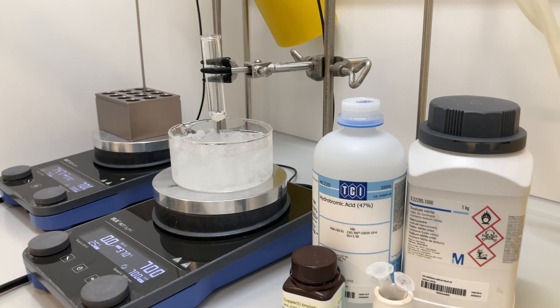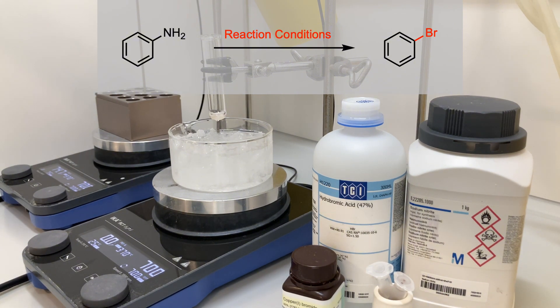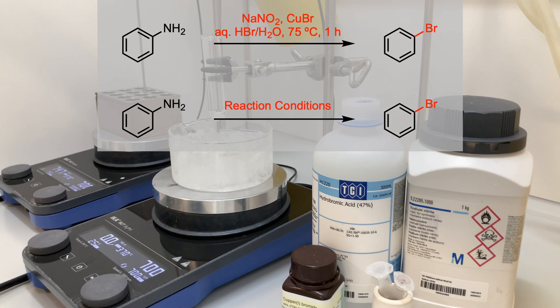For this experiment, I wanted to convert my aniline into the corresponding aryl bromide. Since there are several different conditions to set up this transformation, I decided to test several protocols to identify the optimal conditions for my substrate.